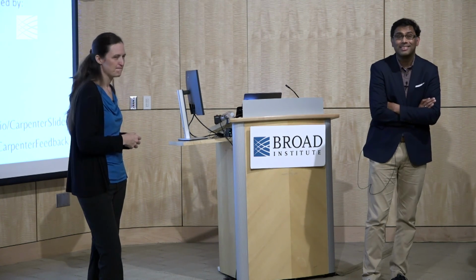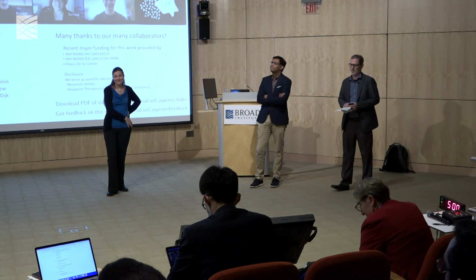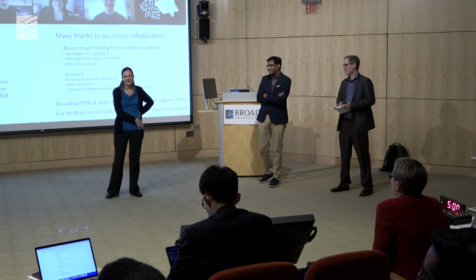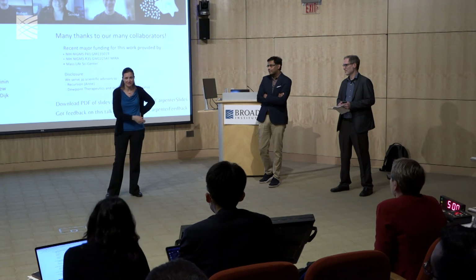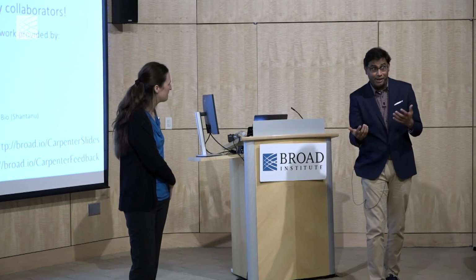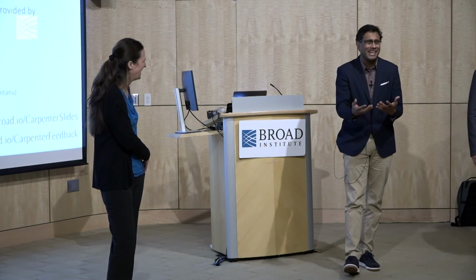And would you say that the morphological features become more distinctive for rare diseases versus common diseases, or any from your experience? I love that question, and I don't know the answer to it. But one could imagine that rare diseases might be more detectable because they tend to have more extreme phenotypes in humans. But it's hard to say. Most common diseases have, of course, a collection of variants. Perhaps the only other thing I can add is that the operator variance matters a lot. Things that Anne can see, there's no way I can see. Just looking at it, I have no idea. So I rely much more in that sense on the statistics.